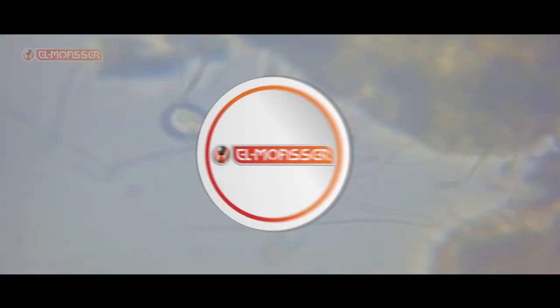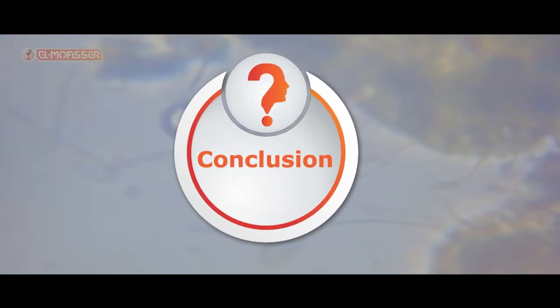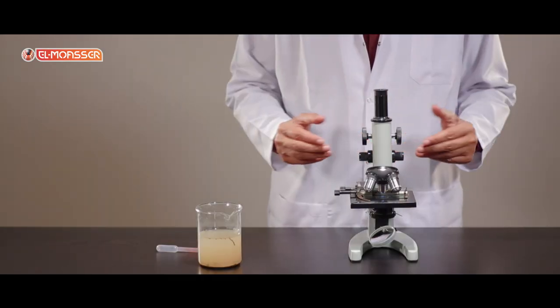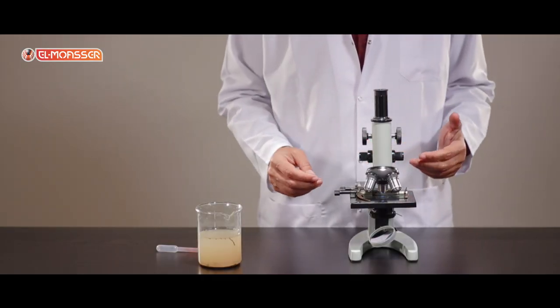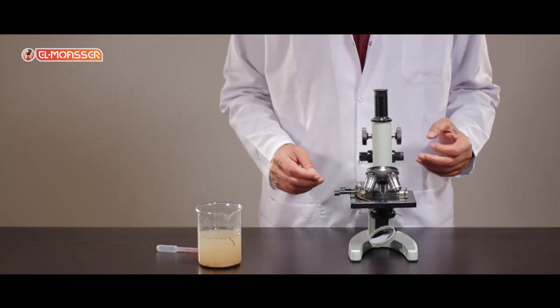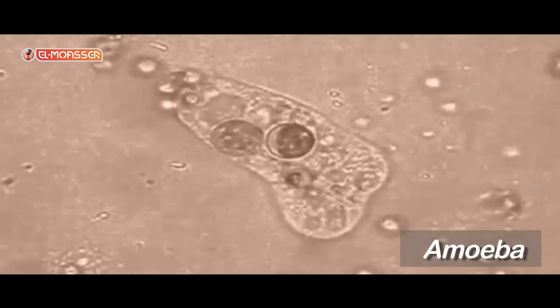that move by flagella. Conclusion: the basis used in classifying protists is the type of locomotion, such as amoeba which depends on pseudopodia for locomotion.